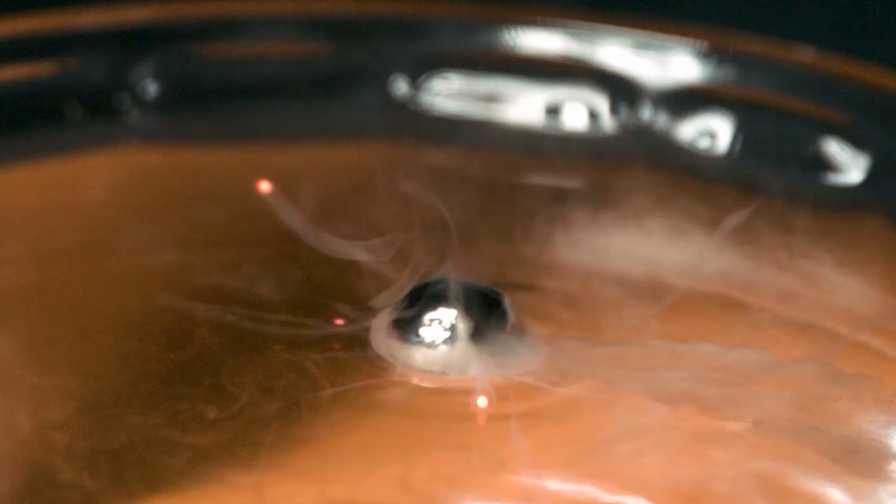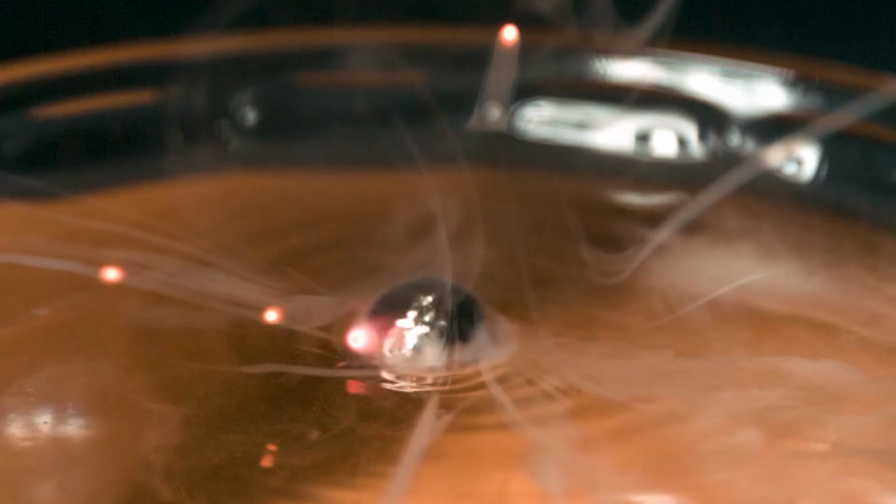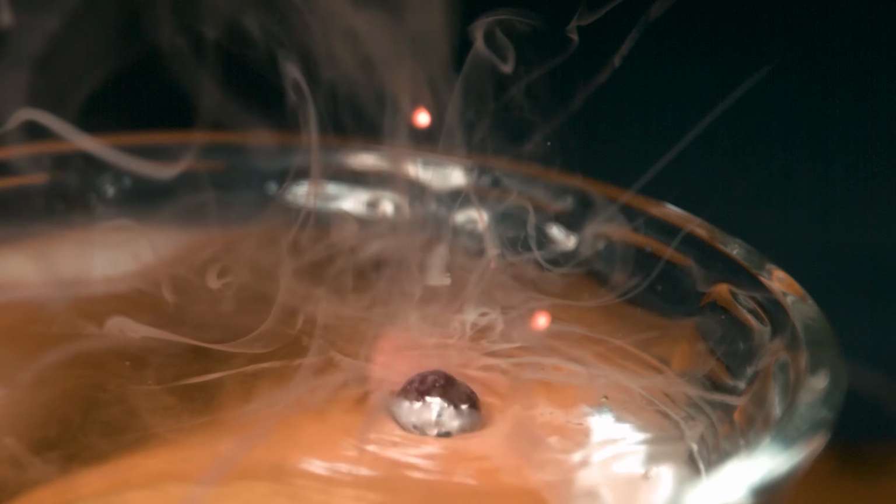You can see the surface of the potassium bubbling and roiling. Obviously it's totally molten now because it's a sphere. And then you can see the flames kind of shooting off of it and kind of like geysers erupting, and then going into more excited times when it's just shooting material off violently in all directions. And then other times it's a little bit more quiescent and getting ready for the big finale there.